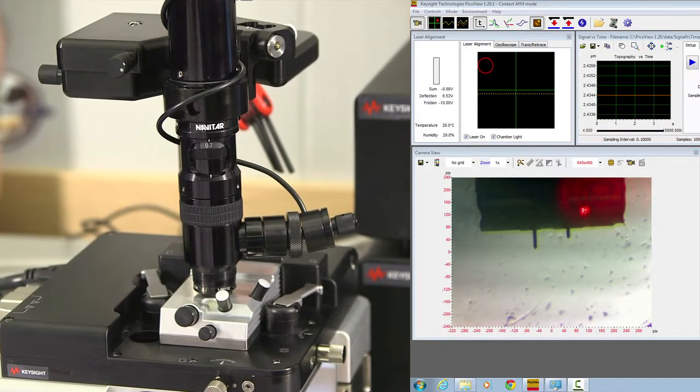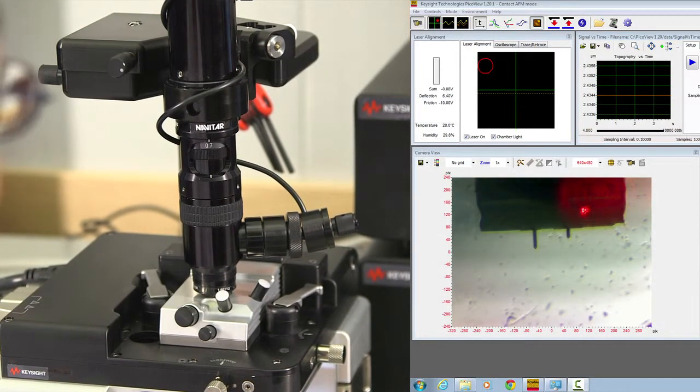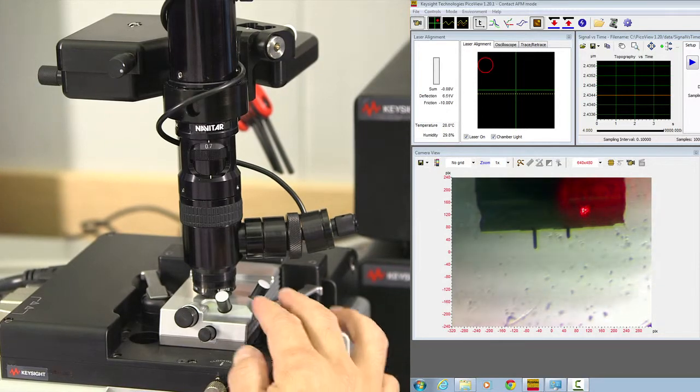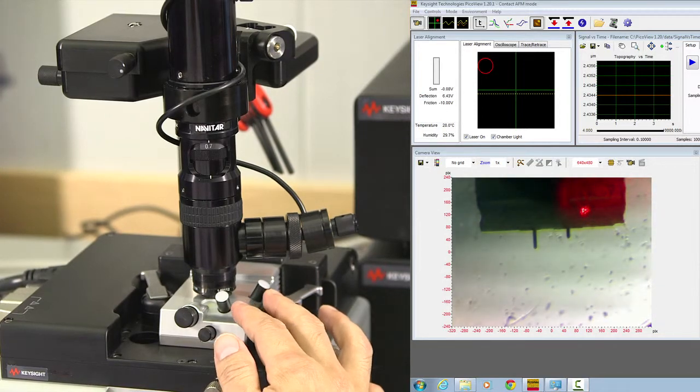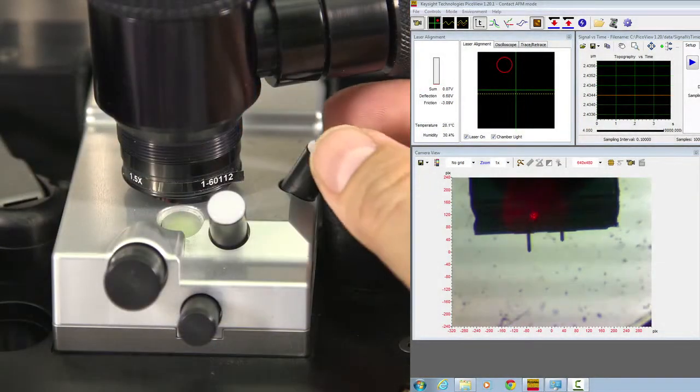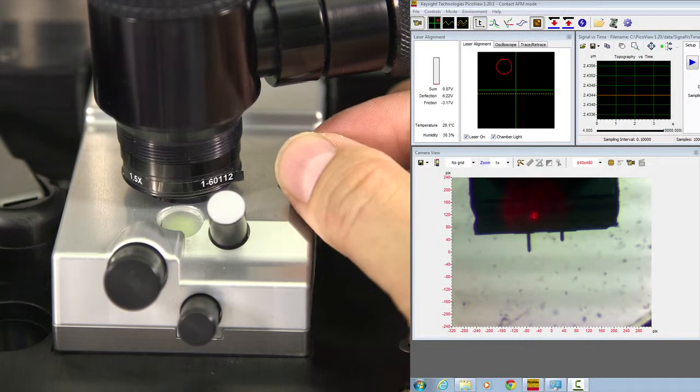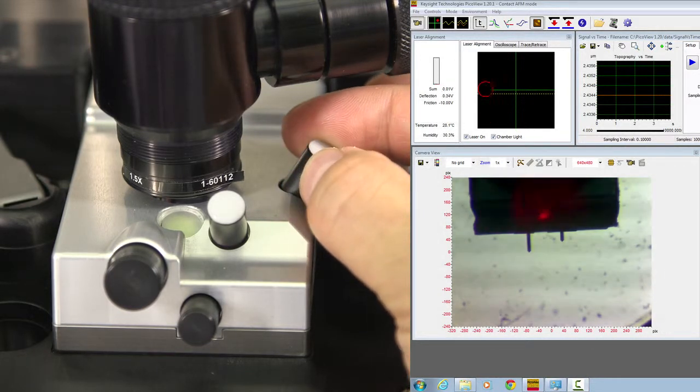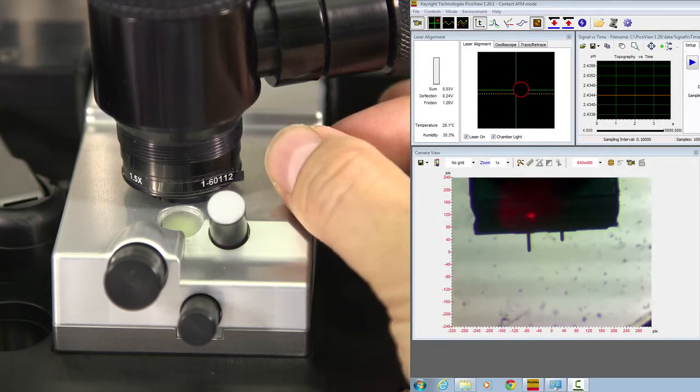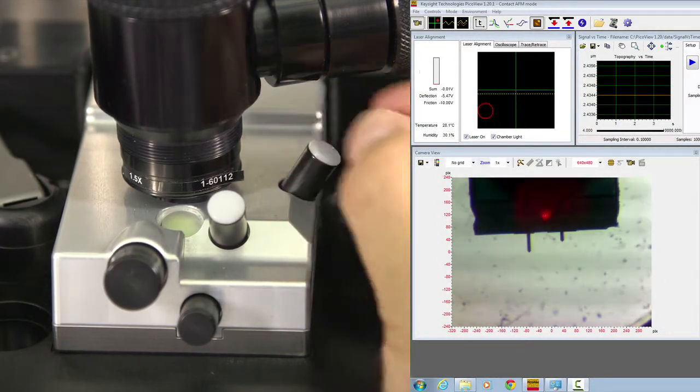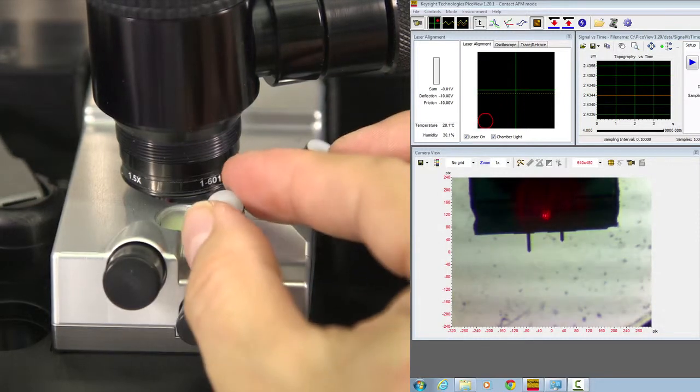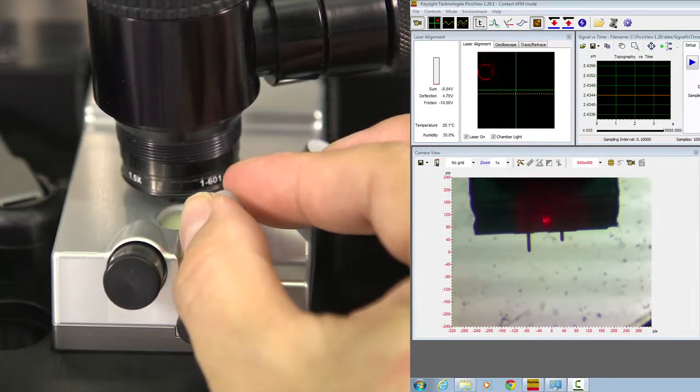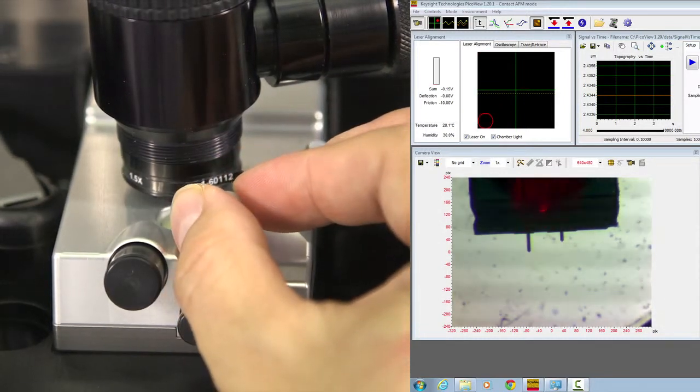Now, the laser adjustment knob is on the scanner. The one on the right-hand side moves the laser spot left and right. The knob on the front moves the laser spot up and down.